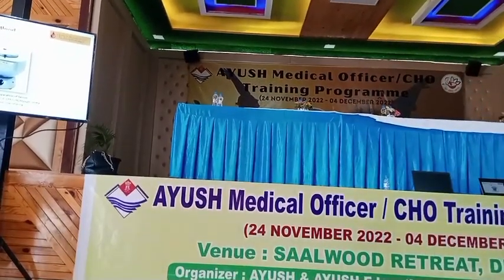Now, this is a centrifuge. I hope all of you have done centrifuges now.